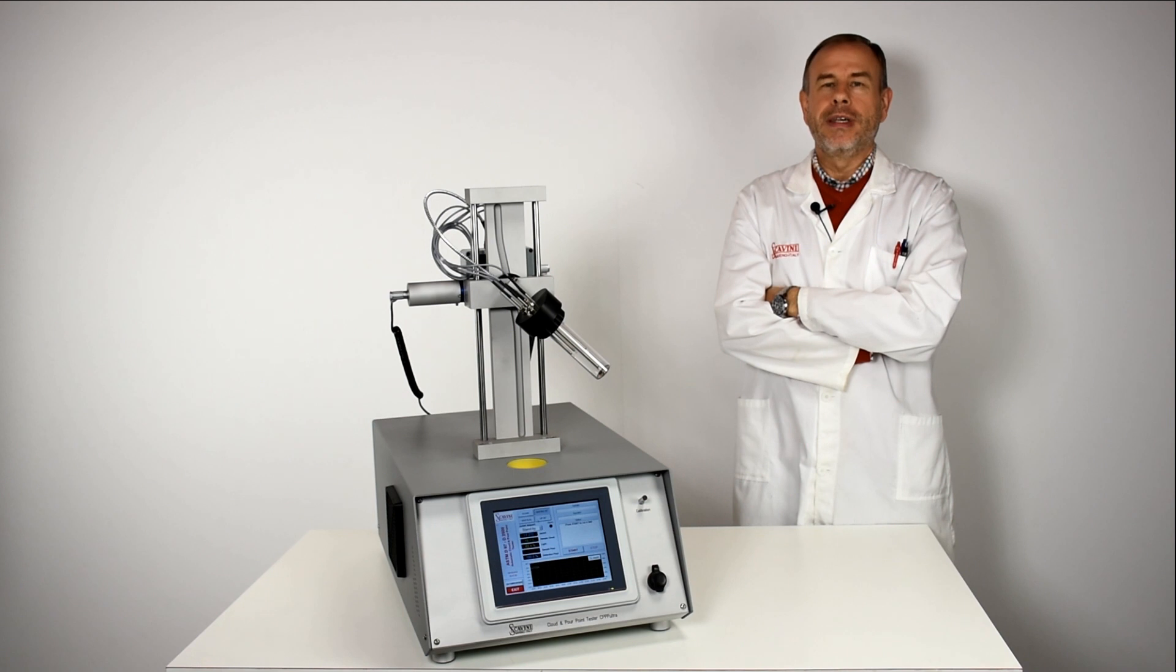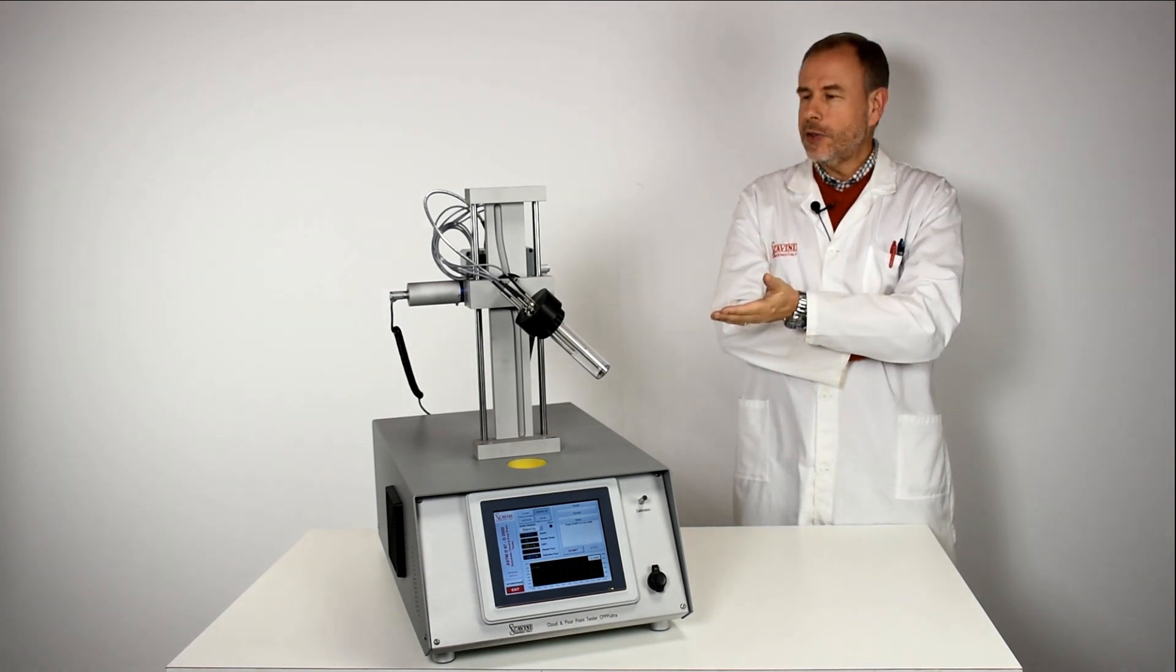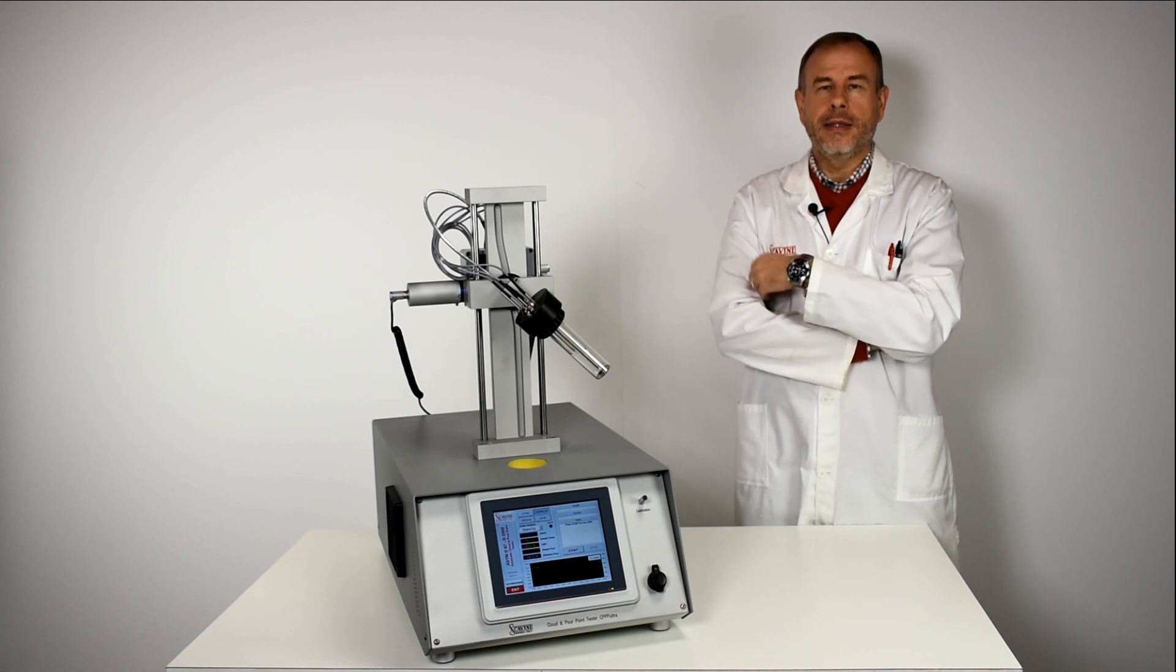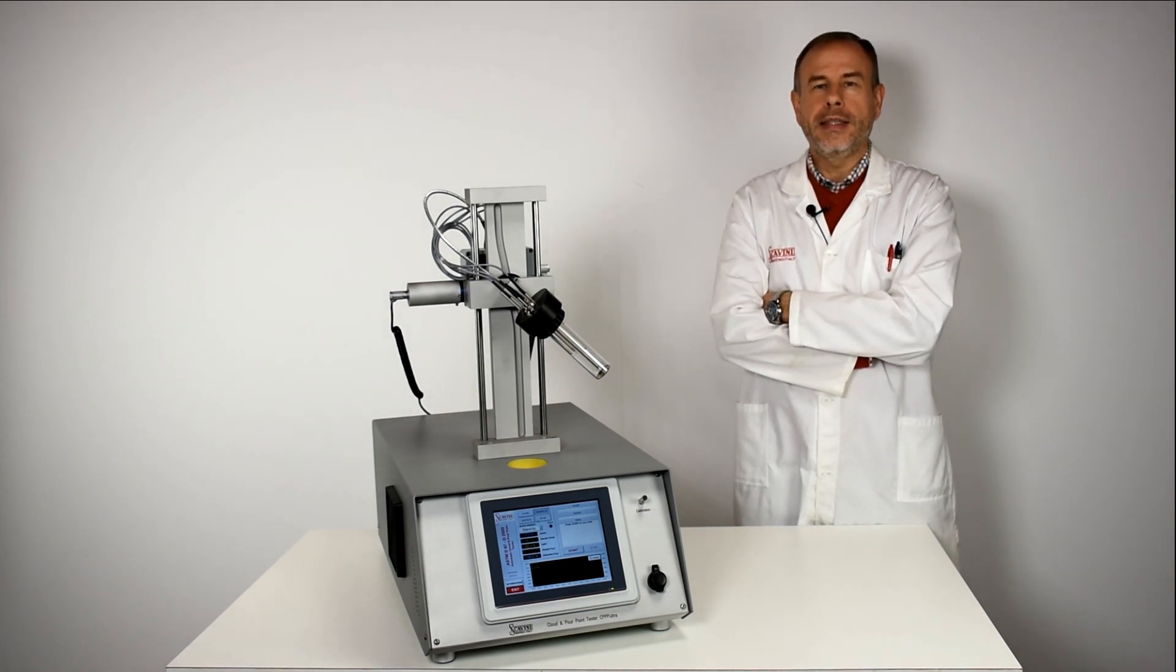Welcome to scaveni.com on YouTube. The apparatus I'm going to show you now is our new cloud and pour point automatic tester according to ASTM D97 and D2500.